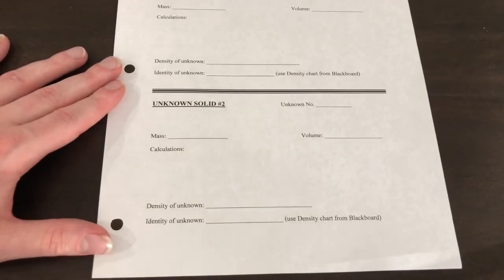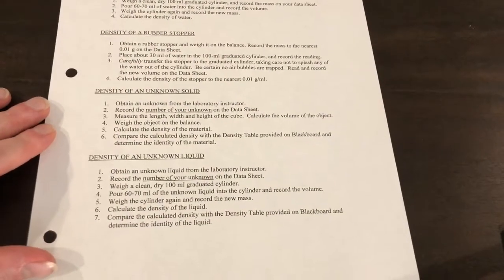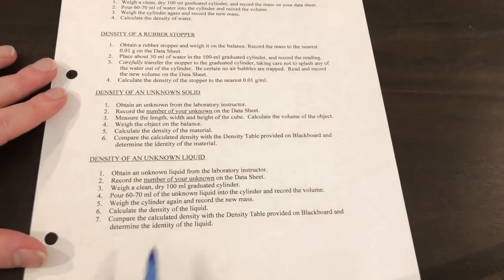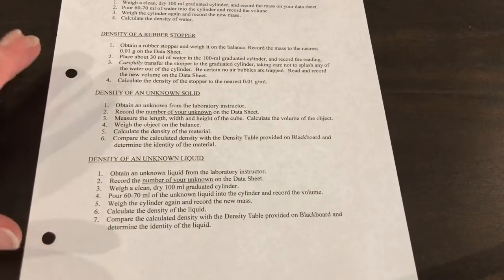Okay, so the last portion of our lab deals with the density of an unknown liquid. So our process is going to be the same as what we did with the density of water, okay?